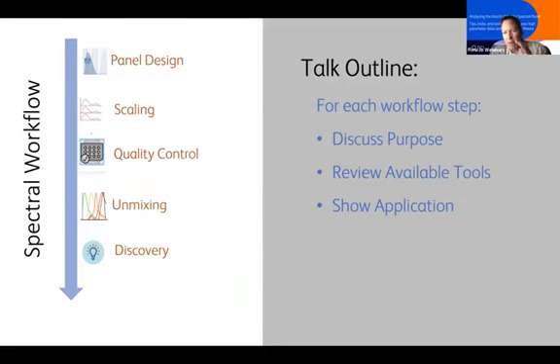And a point of emphasis right off the beginning is that once we have unmixed data that we've collected on a spectral cytometer, it just becomes data. It is high parameter data. And so any tools that you have used in FlowJo or any other software, I will hope a lot of FlowJo users on a FlowJo talk, fingers crossed, that can be applied to high dimensional or high parameter data can be applied to high parameter spectral data as well. The differences are all upstream in the collection, pre-processing, et cetera.